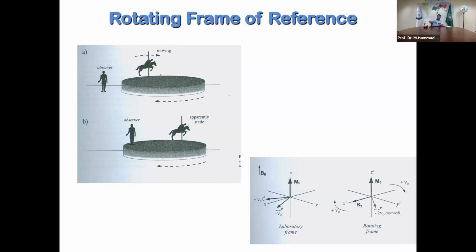If you are standing on a slower moving vector, you're actually lagging behind. With time, you're moving backward, and the others are moving forward. If you are standing on the fastest moving vector, then you're moving forward, and the others are lagging behind.